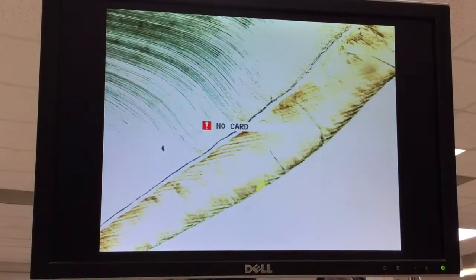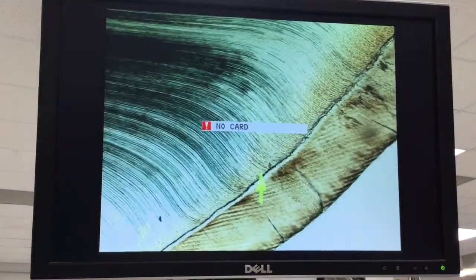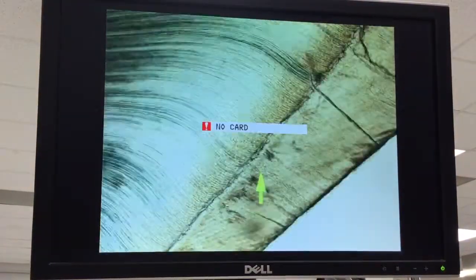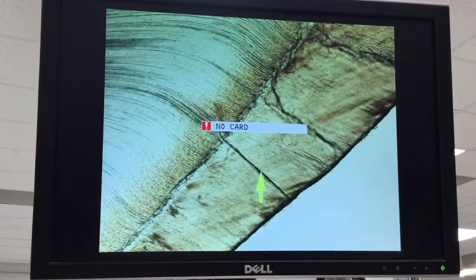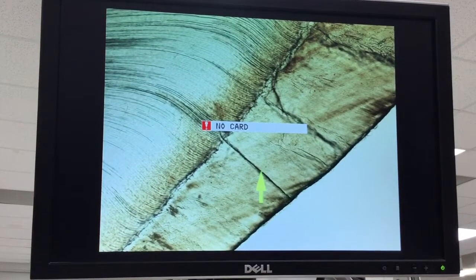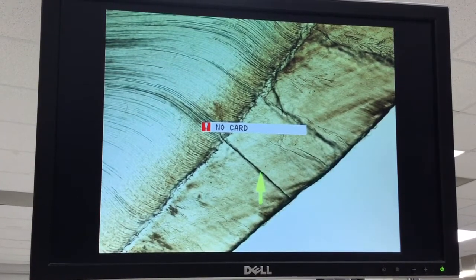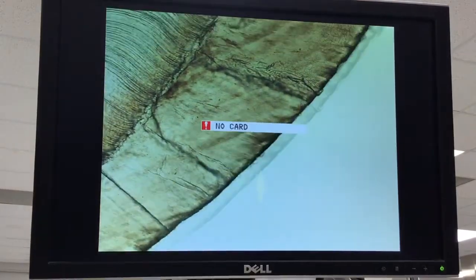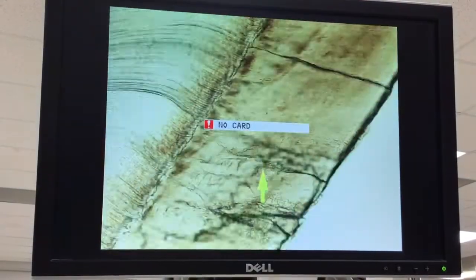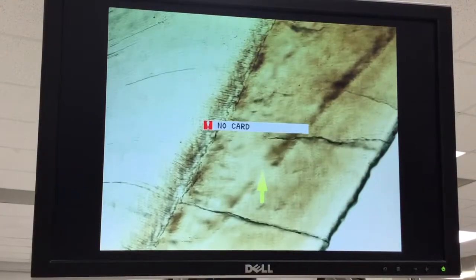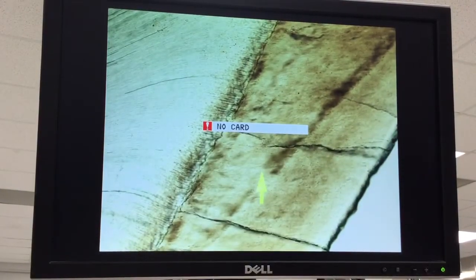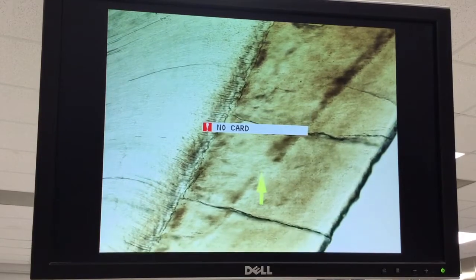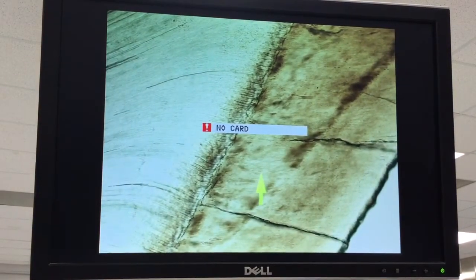Let's look around for some other things on this slide. We can see an enamel lamella right there going all the way from the DEJ up to the surface of the tooth. Sometimes when these are cut in sections, you may not get the entire enamel lamella. And as we go up towards the cusp, you can see more enamel rods. In this case, they're a little bit twisted.